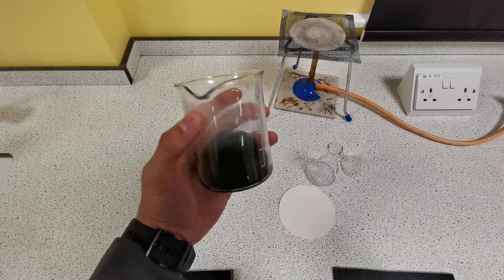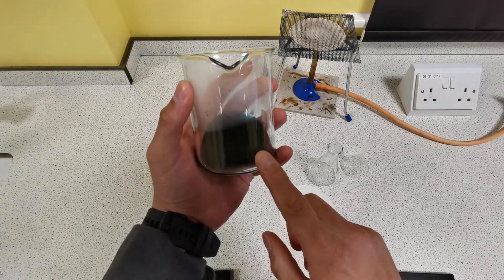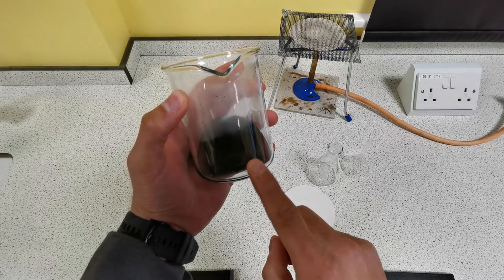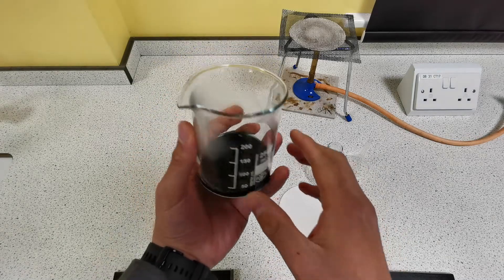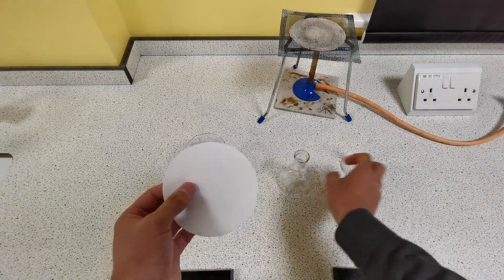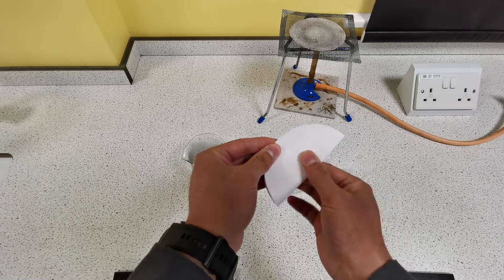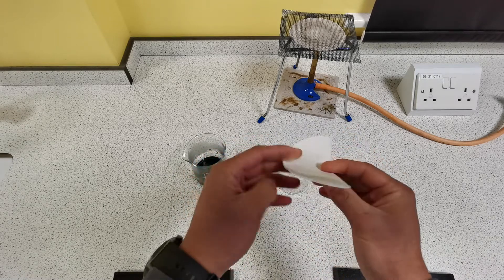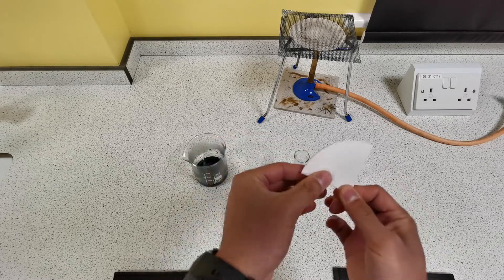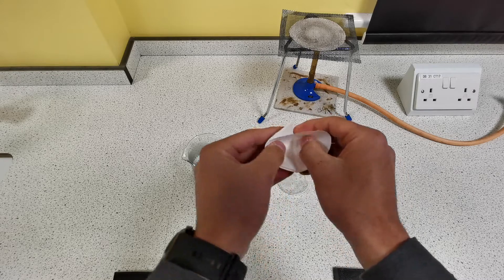Now we have a mixture of copper sulfate, water, and unreacted copper oxide. We don't want that unreacted copper oxide to be in our crystals at the end, so we need to separate it from the mixture. To do that, we're going to use the filter paper, conical flask, and filter funnel. Take your filter paper, fold it in half, fold it in half again, and then open up one of the sides to form a cone, which fits into the top of the filter funnel.